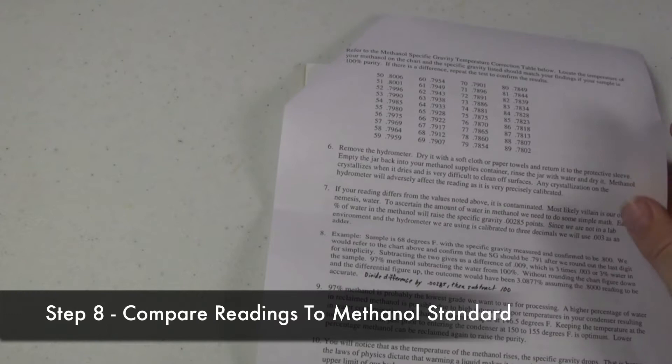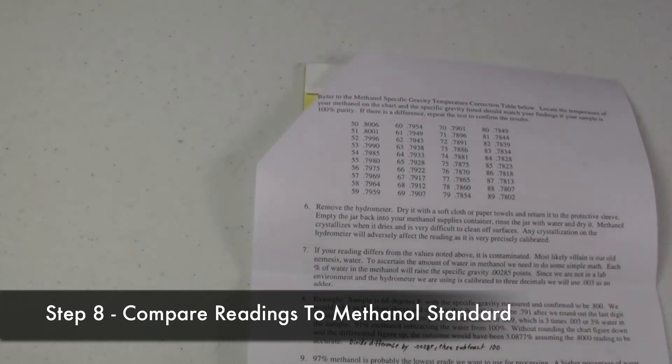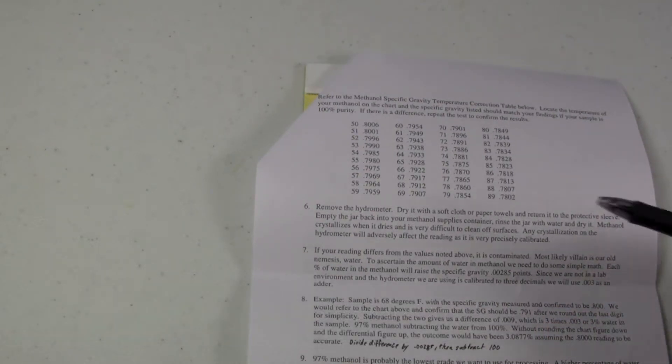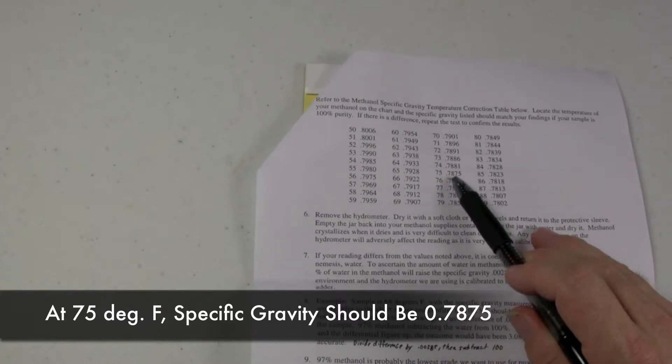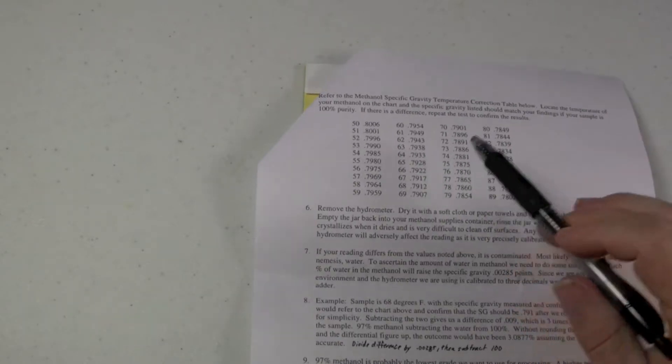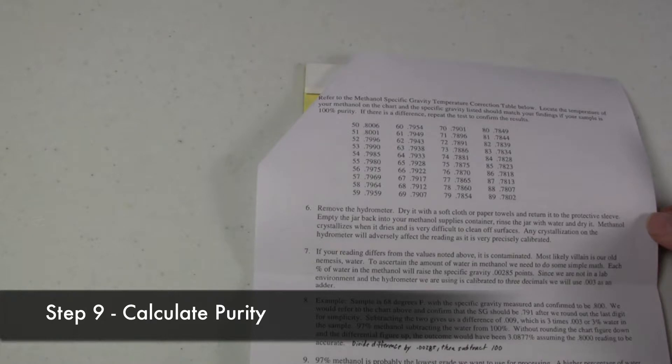What we do is we grab the included chart that comes with our hydrometer. And we look at the temperature at 75 degrees Fahrenheit. Methanol, if it's 100% pure, should be .7875. I think our methanol is pretty pure. For the calculation purposes, let's go ahead and say that it's .788.